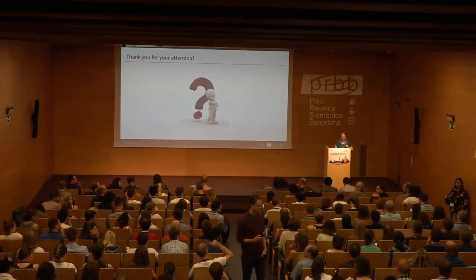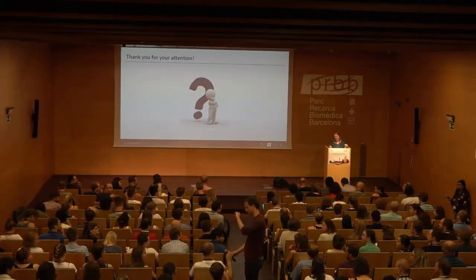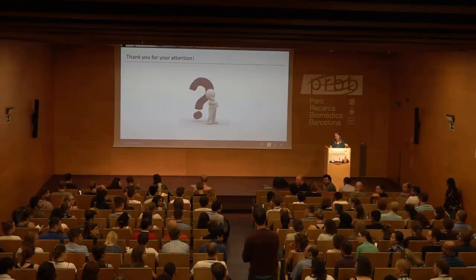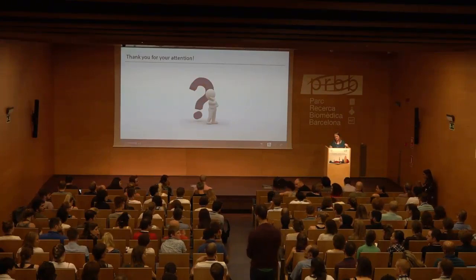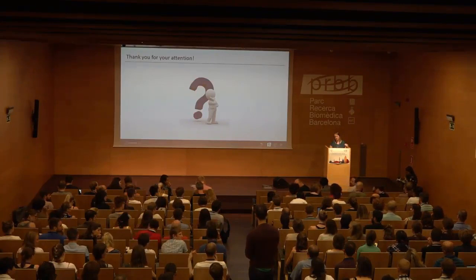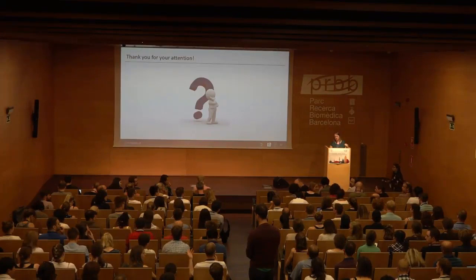Any more questions? Jan? I was wondering if it was possible to include also some physical fragmentation into the prediction, because sometimes you're dealing with, for example, cross-linked proteins, and then you submit them to cross-link reversal, so high temperature overnight, maybe even 95 degrees.